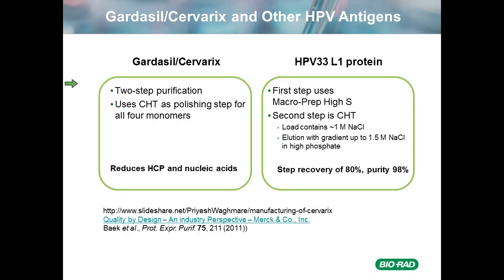Finally, I want to put up two products which are very much in the public eye these days, Gardasil or Cervarix, depending upon where you are in the world, as well as an HPV33 L1 protein VLP. This is all public information, otherwise I wouldn't be able to talk about this, but what you see is that with Gardasil, all four monomers use CHT as a polishing step to reduce nucleic acids and host cell proteins.